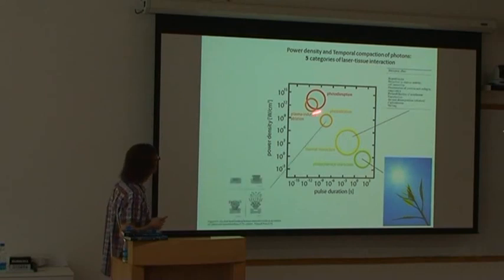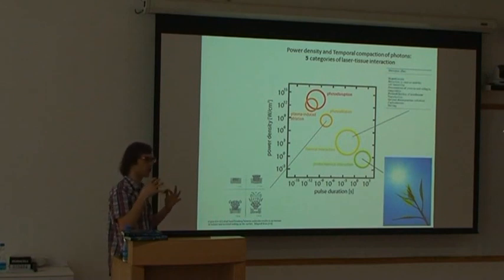If you go higher again, you have photoablation. So photoablation is written here. In fact, you're breaking the bonds between molecules. This will increase locally the volume, and the molecules, in fact, will be etched. Normally, this is used for surface etching.